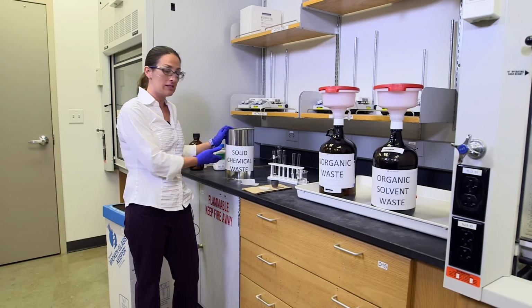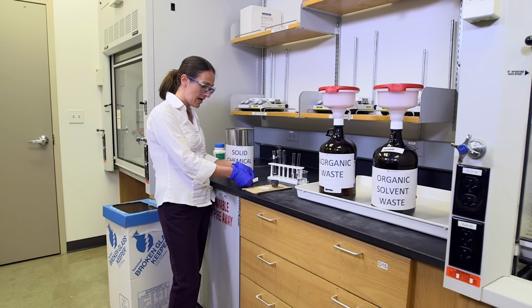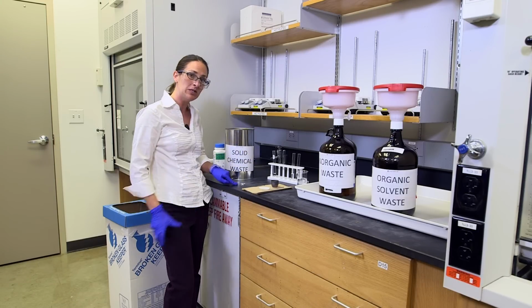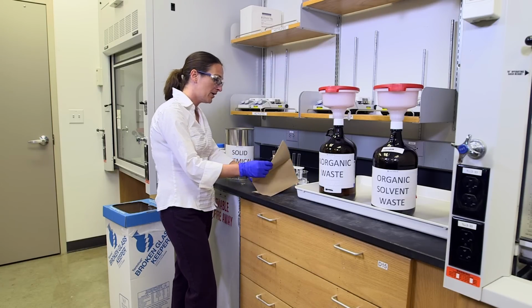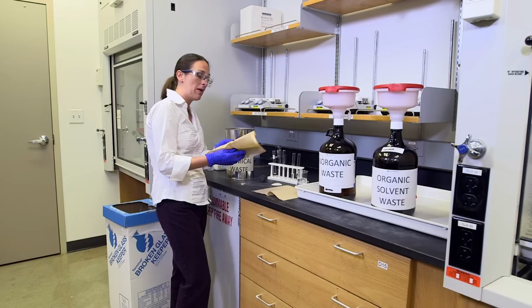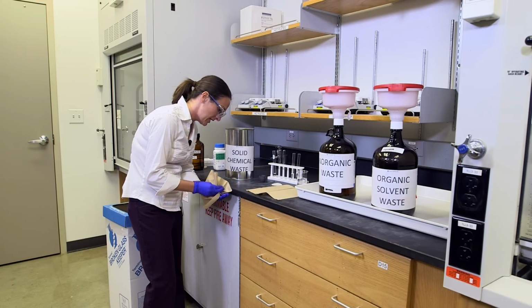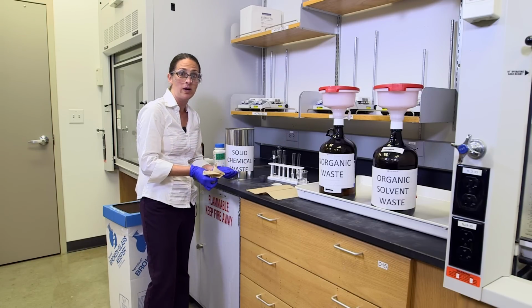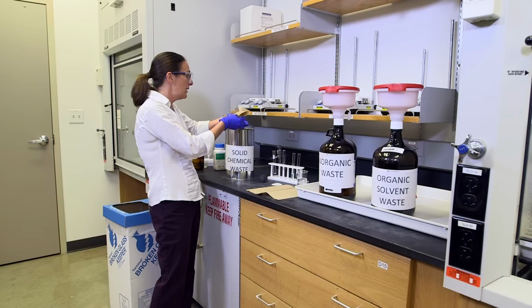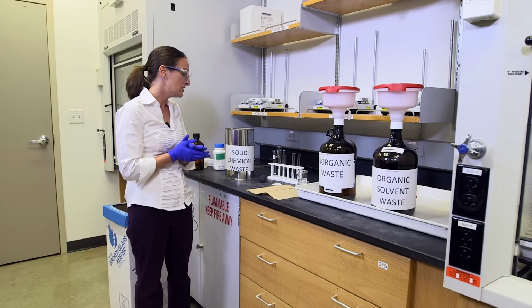Solid waste means exactly what it says, solid waste. So if you're weighing something out and you got too much, don't put it back in the bottle. It goes in solid waste. If you spilled some on the counter while you were getting some out, don't put it back in the bottle, don't put it in the trash can. We're going to use a paper towel to clean it up. We always wipe off the counters. We're never going to leave some sample on the counter because someone else will come in, they'll have no idea what that is. They could spill something else on it that could be disastrous. So the paper towel that you use goes in solid waste.